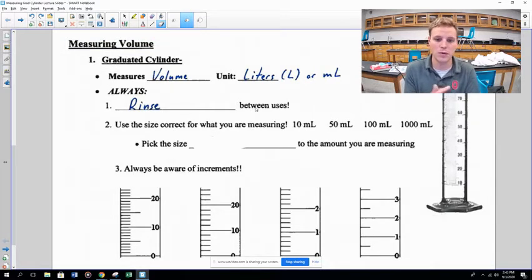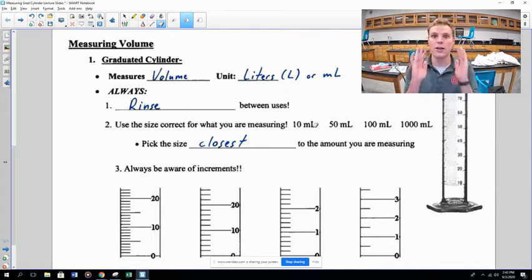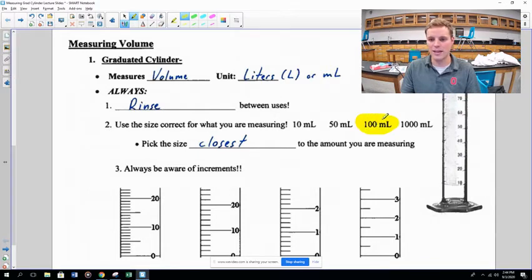There are many different sizes of graduated cylinder, and you'll have a couple in your drawers. When choosing a size, go with the one closest to the amount you need. If you need 91 mL, don't fill a 10 mL cylinder nine times — just use the 100 mL graduated cylinder. Use your common sense; it's pretty intuitive.